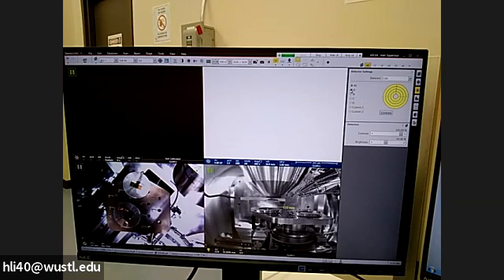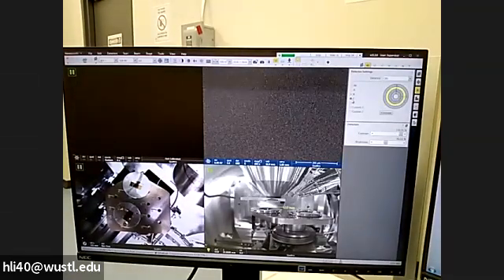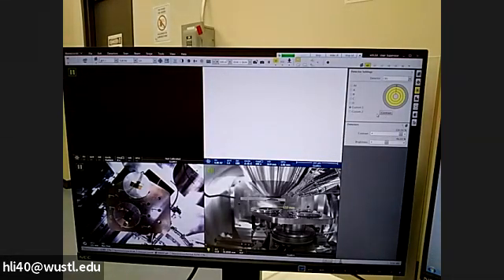For example, you can select the A region only, the B region, or the C region. Or you can customize it. I can click ABC, or we can select A and C. This combination can give you different contrast of your sample in the image. It gives you some information about the geometry, maybe composition too. So this is the detector.